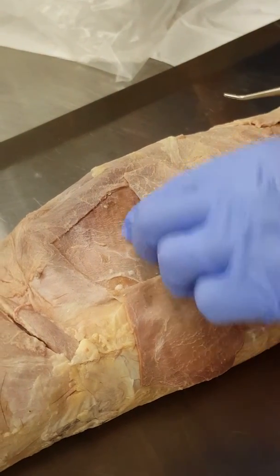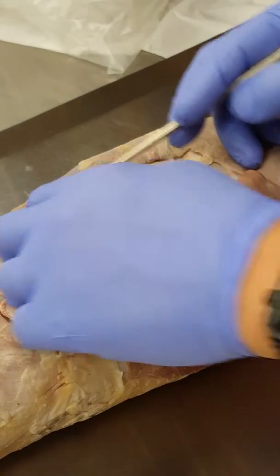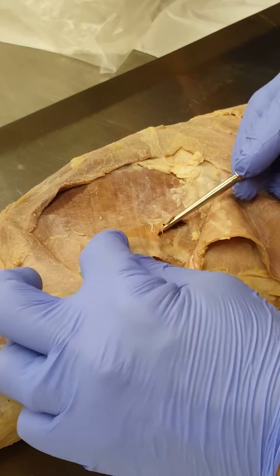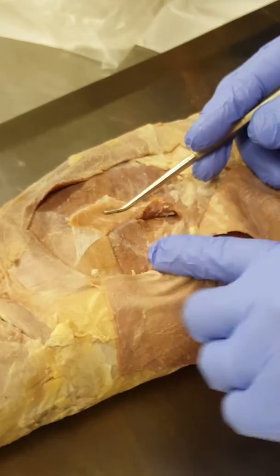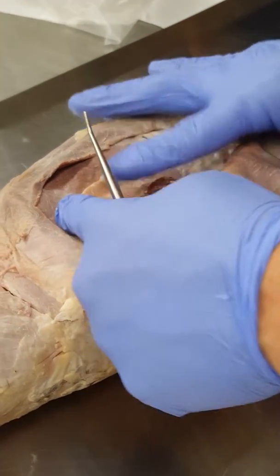Okay, and then once you get past the internal abdominal oblique, did you have it lifted? Did we not? Oh, we went the other way. Okay, good. So right here, we get past the internal abdominal oblique. Then the last layer, the third layer right there, the deepest one, is your transversus abdominis.